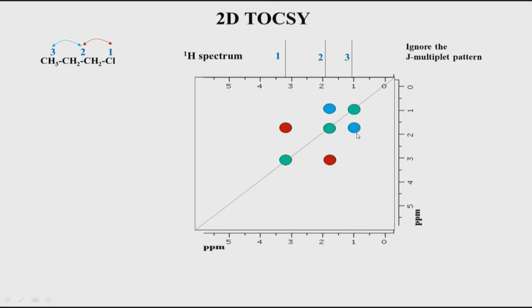This is similar to what you get in a COSY spectrum, because this is the direct coupling between 2 and 3. But in a TOCSY, what will happen is you will get an additional peak shown here, the orange color peak. And where is that coming from? That is coming because of this 1 to 3 coupling through 2. Okay. So, remember there is a through transfer. So, you cannot get this direct coupling straight away, you need an intermediate relay, you need somebody to relay the magnetization from this side to this side. So, if I remove these protons here, I would not have got these peaks.